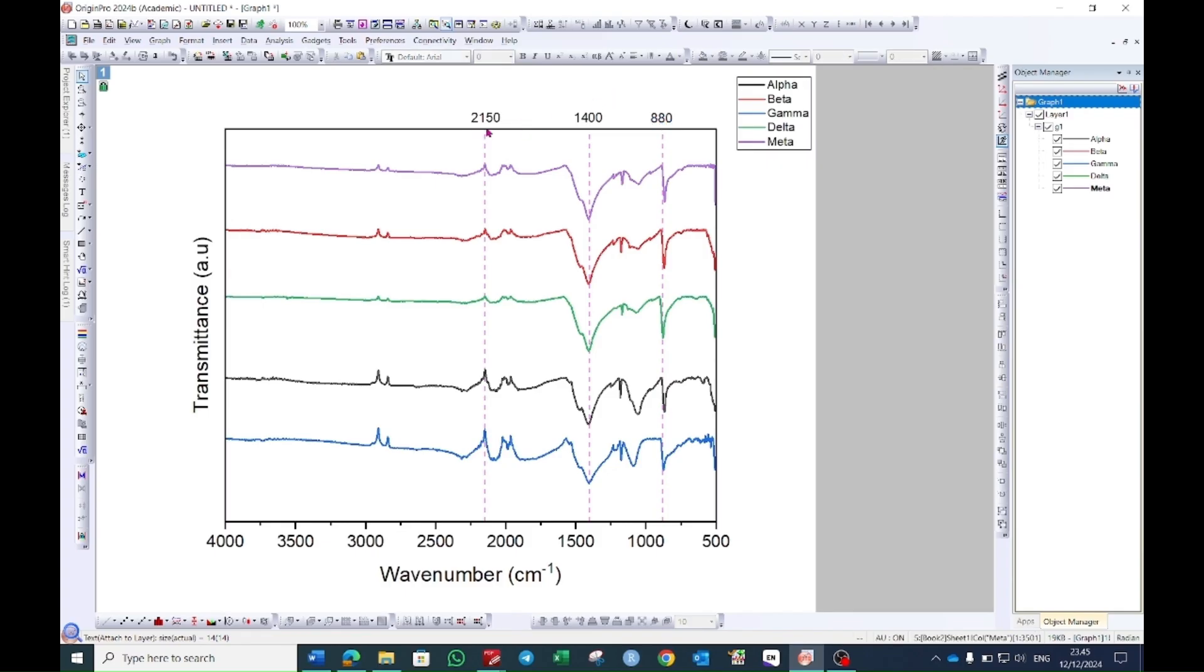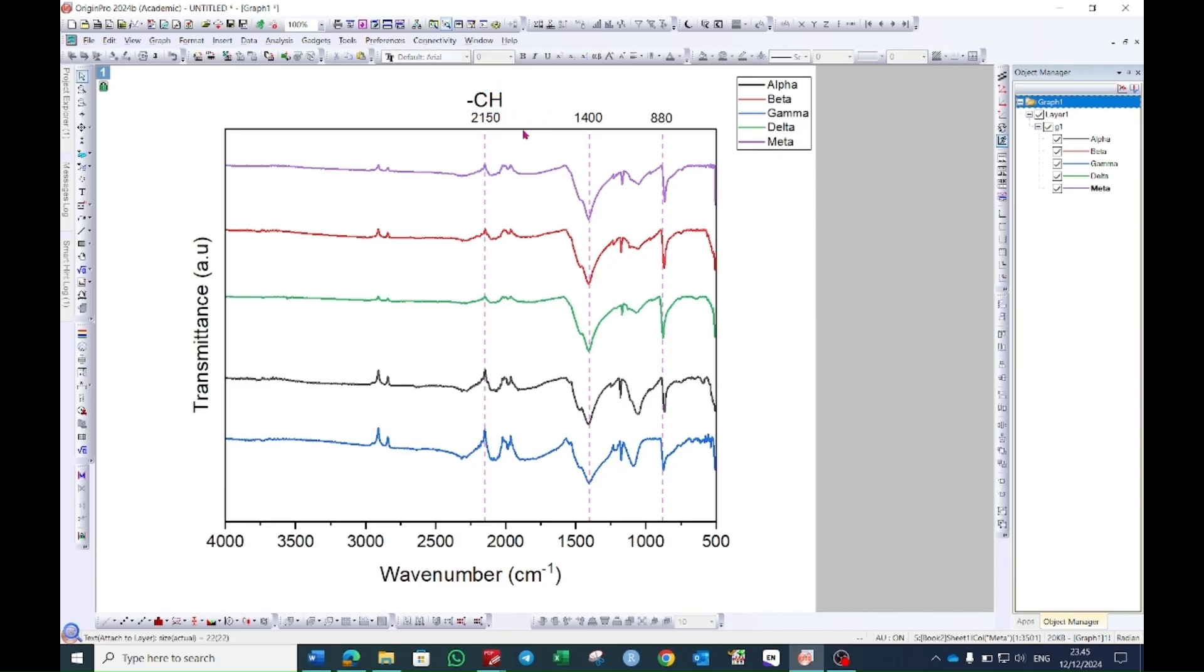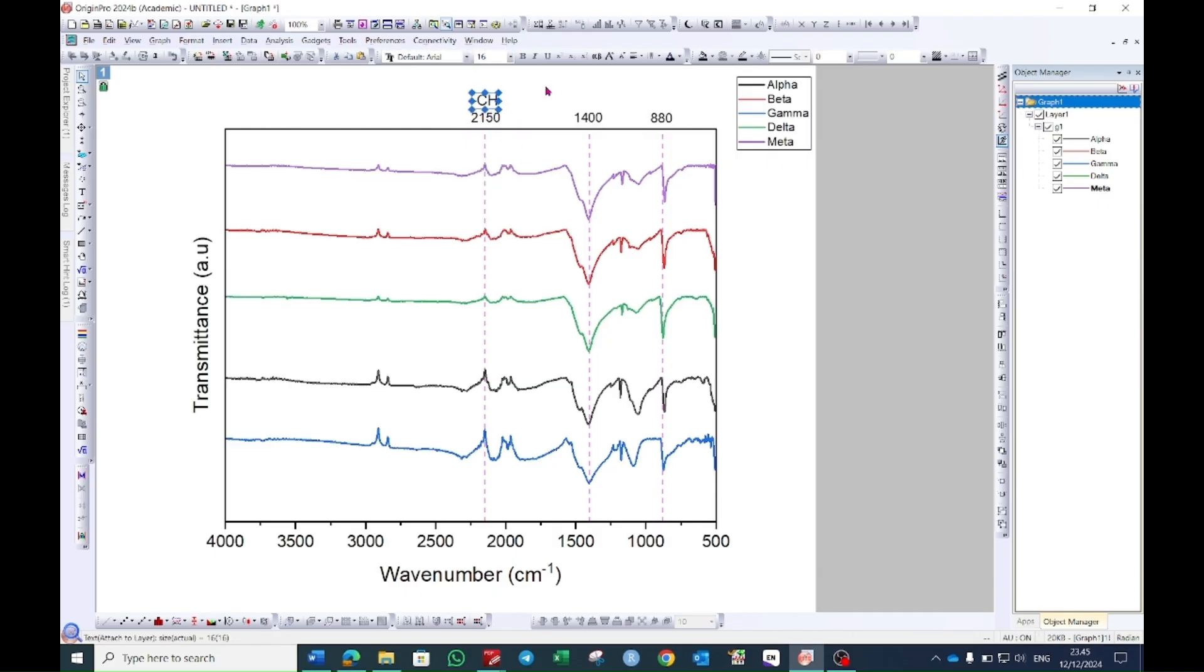Now you want to show what functional groups are present on this peak. You can see here the option text tool. Just click on it and then click on this peak value and then you can plot the functional group which you think is this one and then you can also change the size of it.